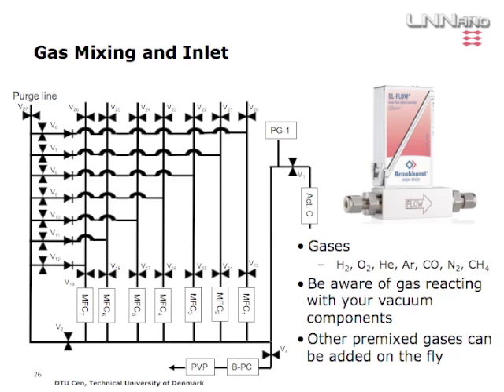Here we have a bunch of filters. I just indicated the active carbon filter, but we have a bunch of filters that we can use to make sure the gas is as clean as possible before we introduce it into the microscope. We also have other auxiliary lines, so if you want to use something else in this, we can just add it on the fly.